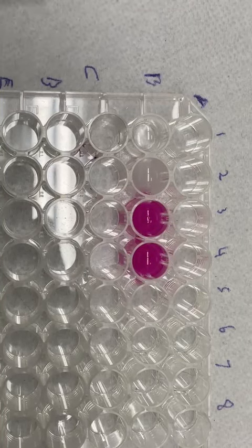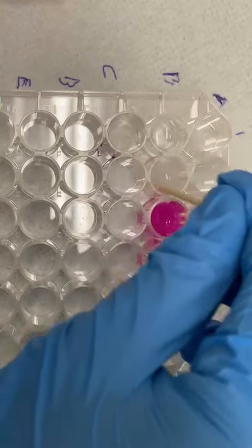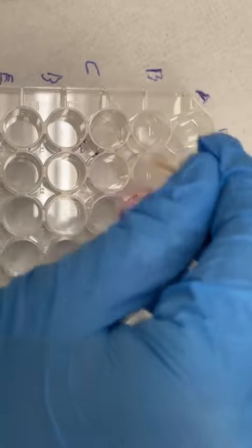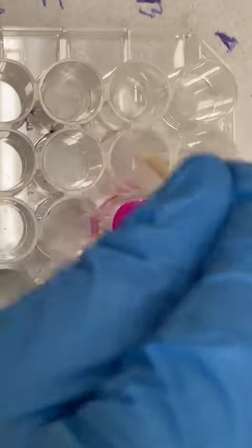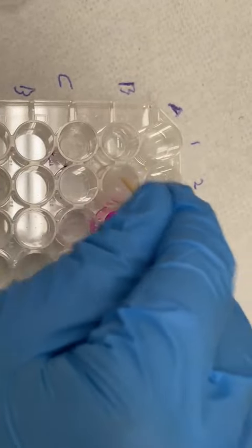We have to continue stirring it until it changes color now. That looks a bit more fungish. Unless... I could just be joking. It's kind of like a little... So you keep adding drops? Yeah, until you see a change.